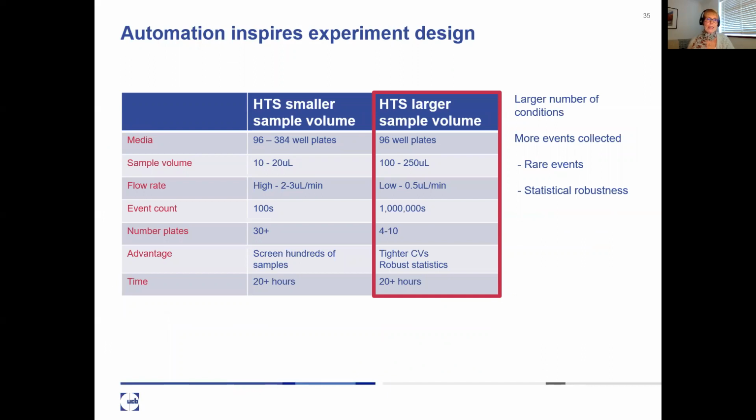So one of the interesting outcomes after the installation of this system was how change was inspired to a certain extent in some of the experiment designs. This was particularly evident in larger volume experiments. It's interesting how an extended working day can shape experiment design if you need to sit and feed your plates to the cytometer.